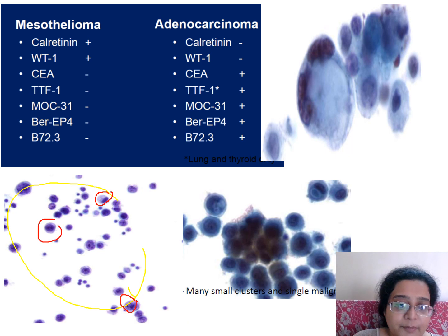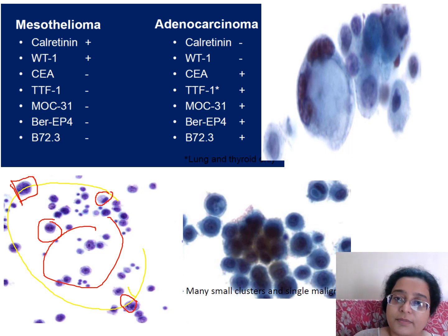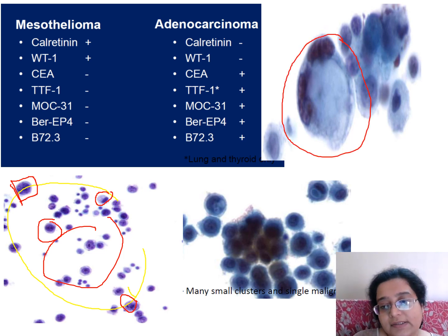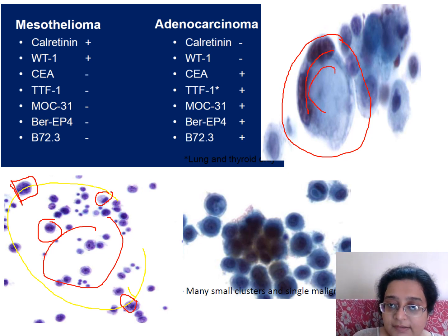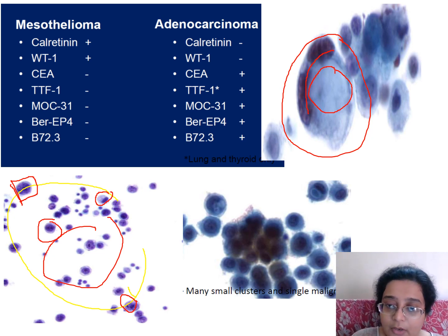Then these atypical looking cells, I honestly will not be able to tell you 100%, but this cell I will find, okay, this could be a suspicious cell. Then I'll go ahead and look at another space, say this cell. Yes, such a cell you can see in a reactive population also, but why is the nucleus pushed to one end? Means there is something inside which is pushing. So what is this which is inside? Is it normal fluid? Normal pinocytosis I showed you, the nucleus is not so compressed, so this could be mucin. And if I'm doubting mucin somewhere, then I have to think of adenocarcinoma.